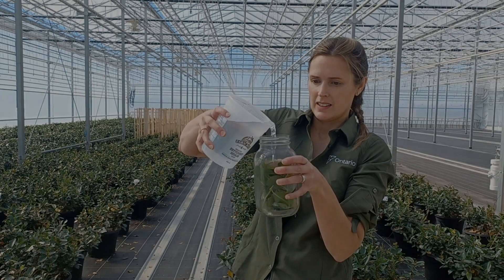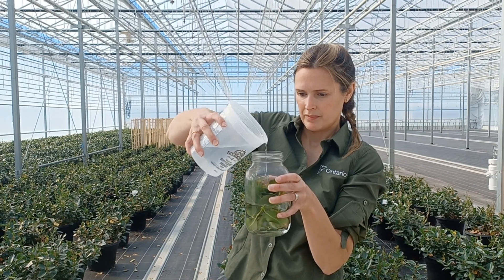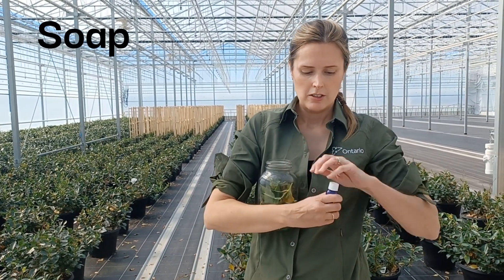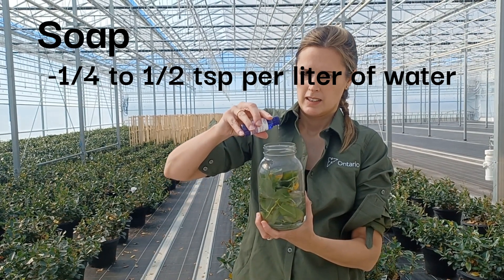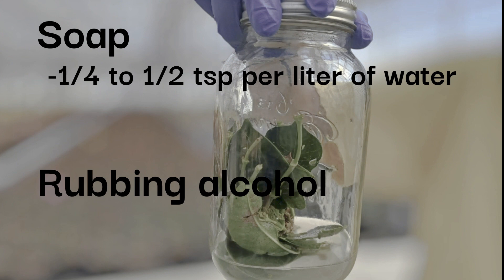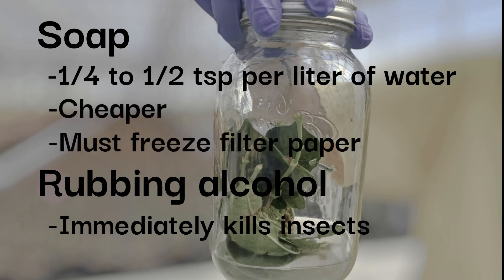Once you have your plant samples in the collection container, fill it with enough water to just cover the plant material. Then add a small amount of soap — just enough to break the surface tension in the water, roughly about a quarter teaspoon to half a teaspoon per liter of water. Alternatively, you can use rubbing alcohol instead of soap and water. Whether you use the soap or alcohol method is up to you. Alcohol has the benefit of killing the insects immediately. Soap is cheaper, but you will need to put the filter paper in the freezer after straining to kill the insects before counting.